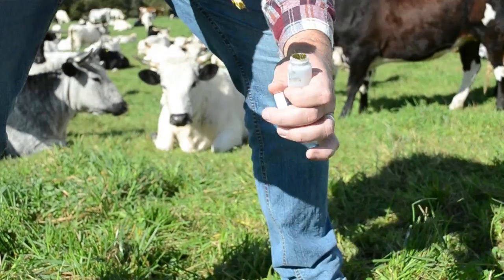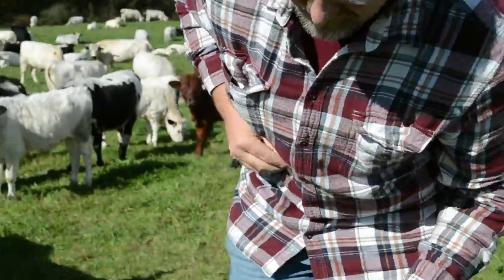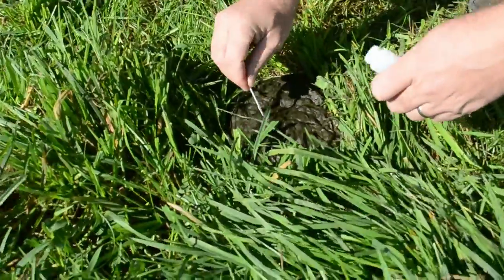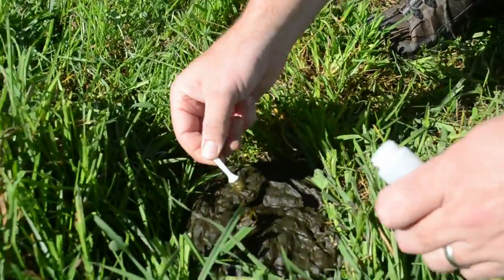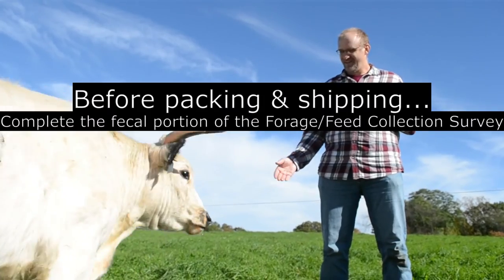Discard the spatulas when you're finished. Seal the tubes up and place them back in the bag with some newspaper if possible. Freeze overnight before mailing. Don't forget to submit the fecal portion of the forage and feed collection survey.